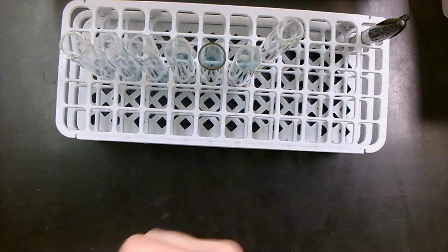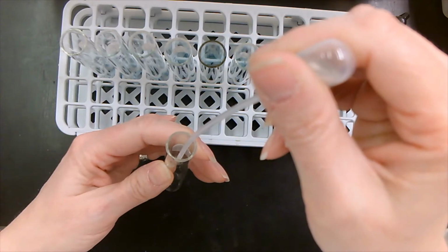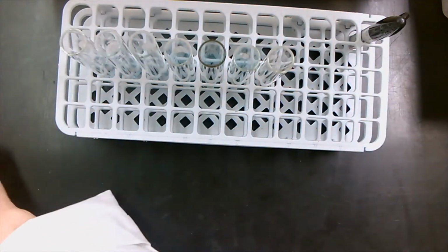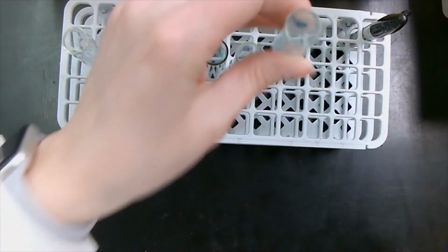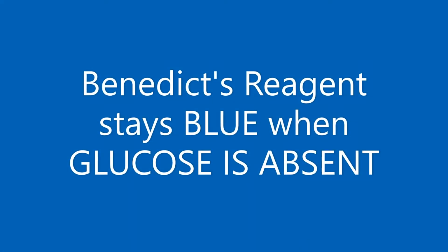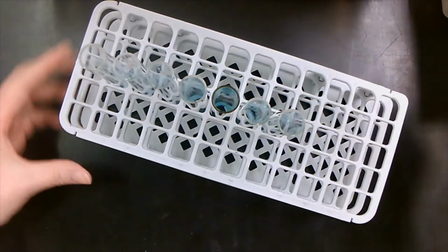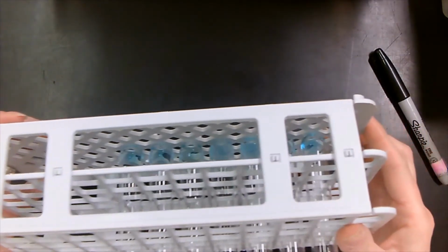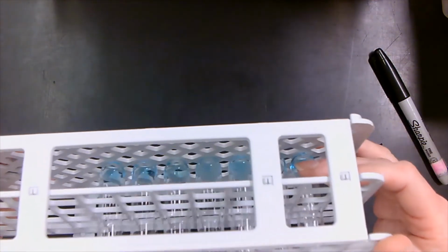And finally, for our last test tube, we are going to add sucrose, also known as white sugar. This is the white refined sugar. And finally, our Benedict's. So, if we're looking at our test tubes, right here, we can see that all of them are blue. They all have our Benedict's in it. So now, this is our before color, okay? The Benedict's stays blue for all of them before.